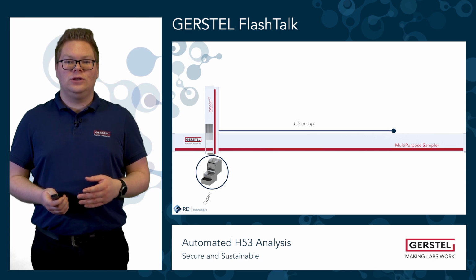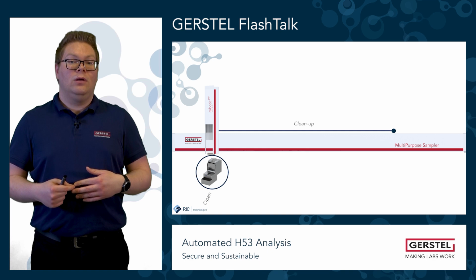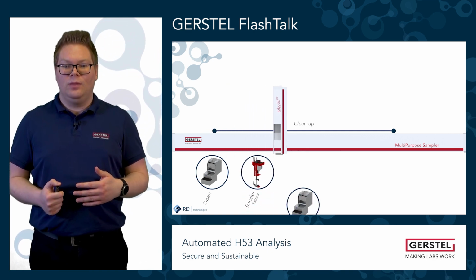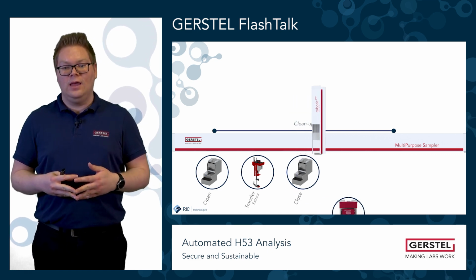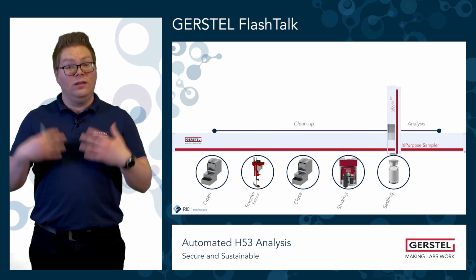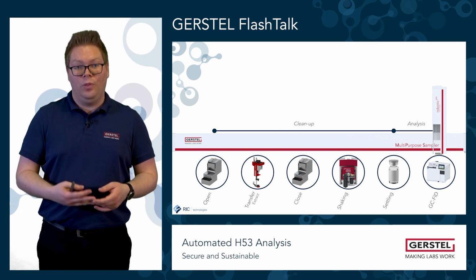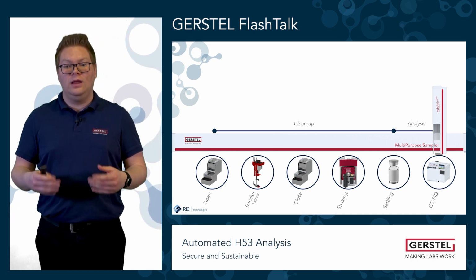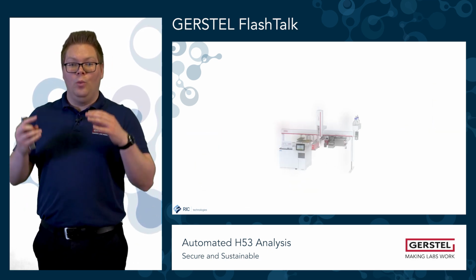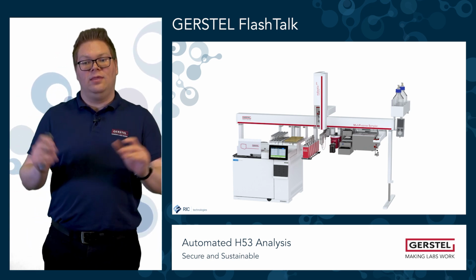After the liquid-liquid extraction, we continue with the cleanup, beginning again with opening our vial with the decapper-recapper system, transferring the extract phase, and then shaking and settling. After the extract is settled, the analysis directly begins with the injection of the extract phase into a GC-FID system. And the complete system with GC-FID and the automated sample preparation then looks like this.